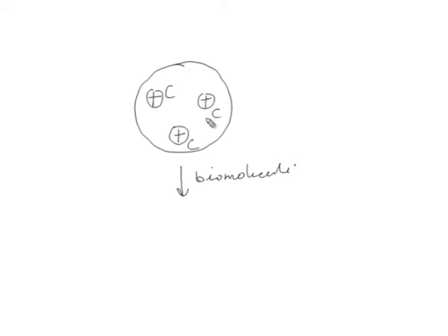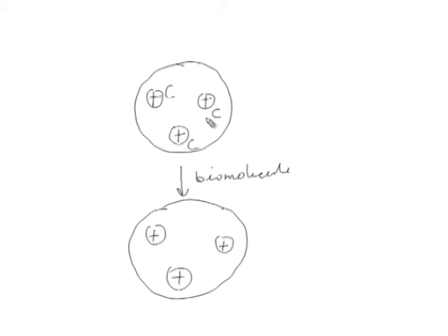They will replace the counter ions, because they have high affinity for the resin. So, protein molecules carrying negative charge will bind in here.